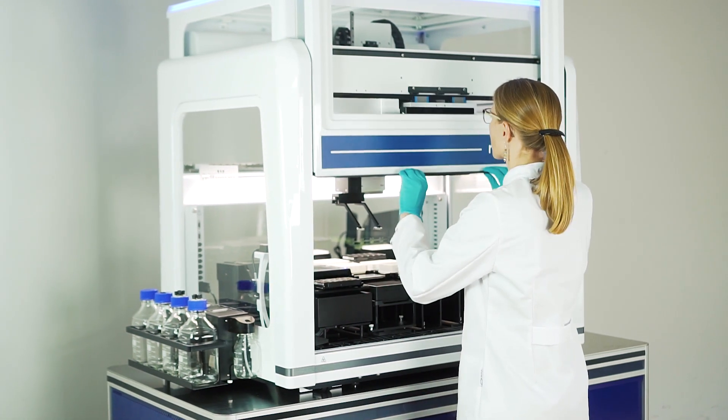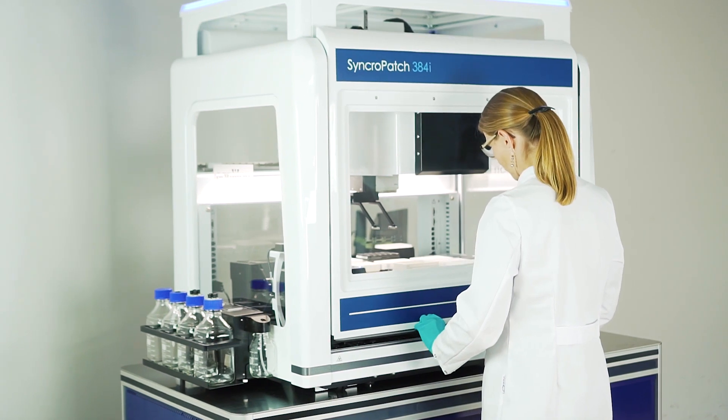We have more than 25 ion channel SA experts globally located who are waiting to take your call. Get in touch today.